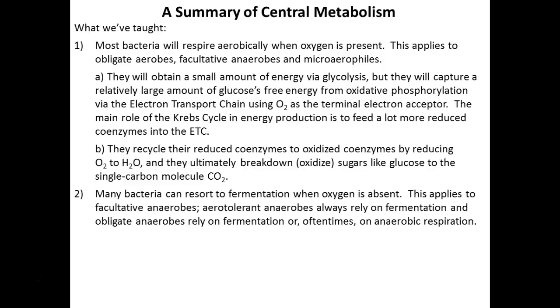But the take-home message is mainly we produce what? 3 main compounds can be produced from fermentation in general terms. What does the yellow tell us in the phenol red tubes? Acid. What does the bubble tell us? Gas. What does the VP test tell us? Alcohol. Right?